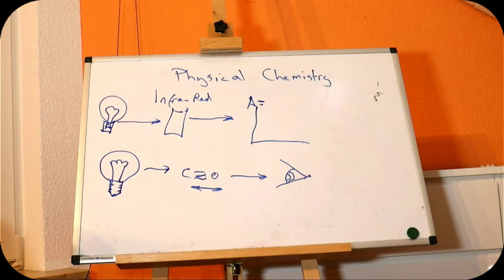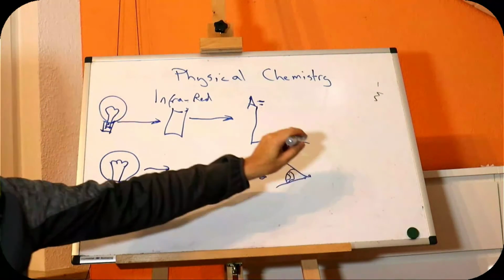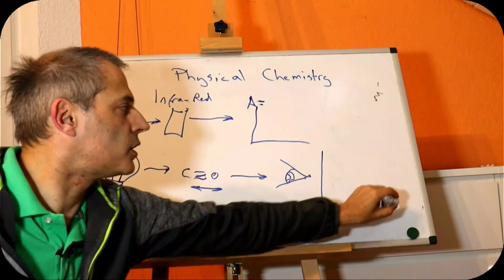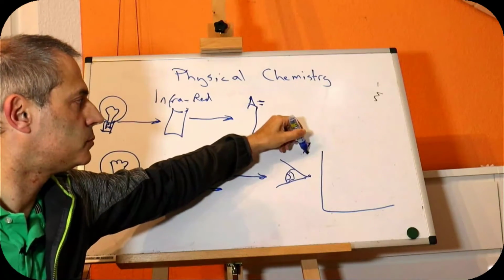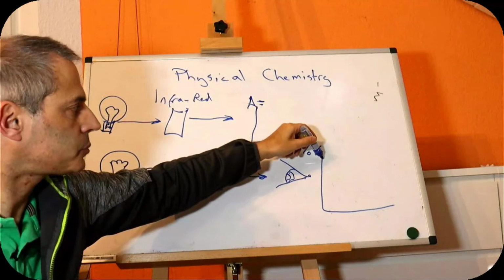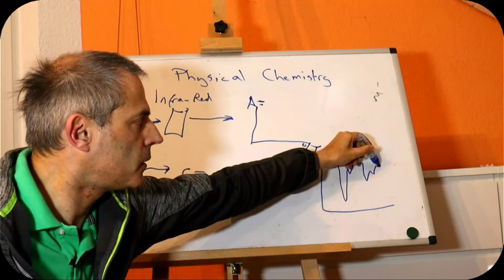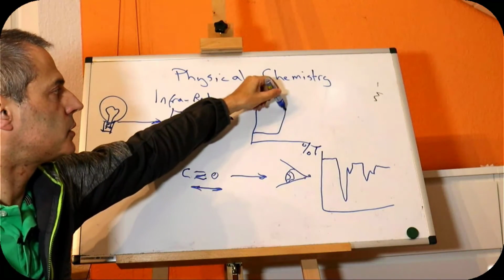It is used sometimes, but very often we use a transmission scale, which means that the graphs are usually measured in percent transmission, which is very unhelpful, with wavelength on the other axis, and then we have peaks that go downwards, whereas absorbance peaks go upwards.